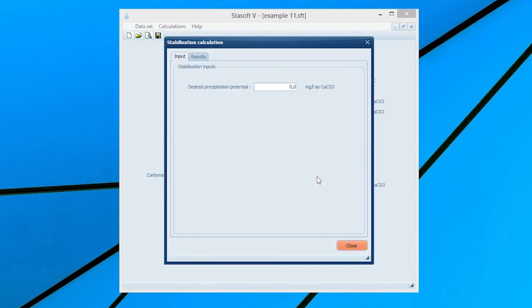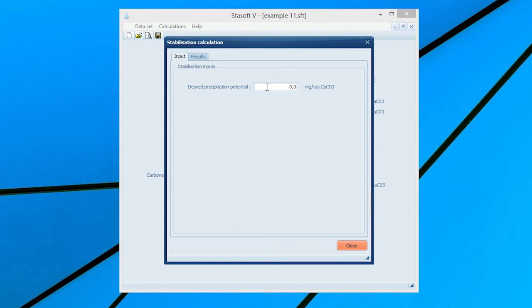Select Yes and the Stabilization Inputs window for the recarbonation of the present or active water will come onto the screen, allowing input only for calcium carbonate precipitation as carbon dioxide is used for recarbonation. If recarbonation of the water after lime dosage is not required, the user can simply select No to continue with other program functions. Enter the required calcium carbonate precipitation potential of 5 mg as calcium carbonate by typing 5 into the desired precipitation potential input box.